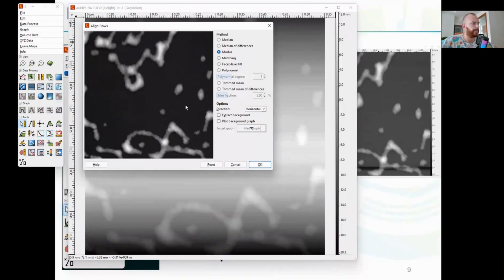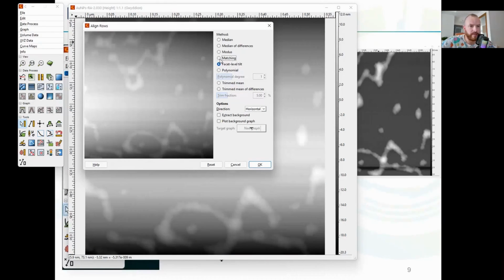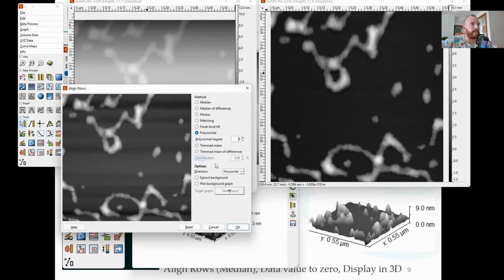I would really recommend you to follow all this stuff with me, because I will point out just very important aspects. My recommendation to you is to play with this data at home with Gwyddion. So you just try all these methods.